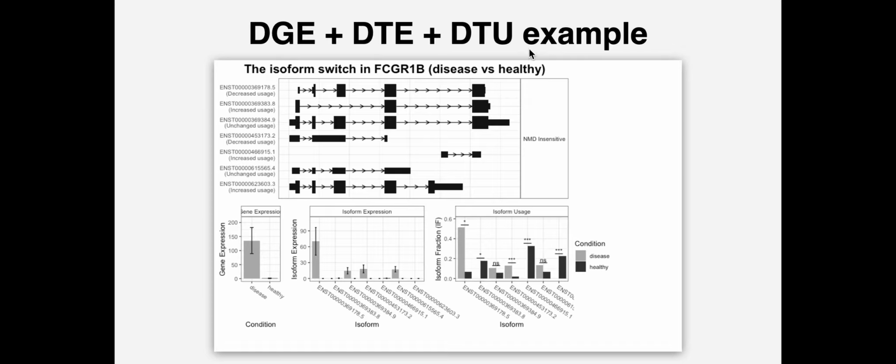And although it's significant for differential transcript usage, I'm not sure I really value the DTU analysis in that case. And I'm not sure I would do a DTU analysis in this way for disease and healthy, because I know there's many genes changing dramatically in skin of patients with the disease versus healthy controls. This is an analysis you might carry out in a comparison that's a little more subtle than disease versus healthy.